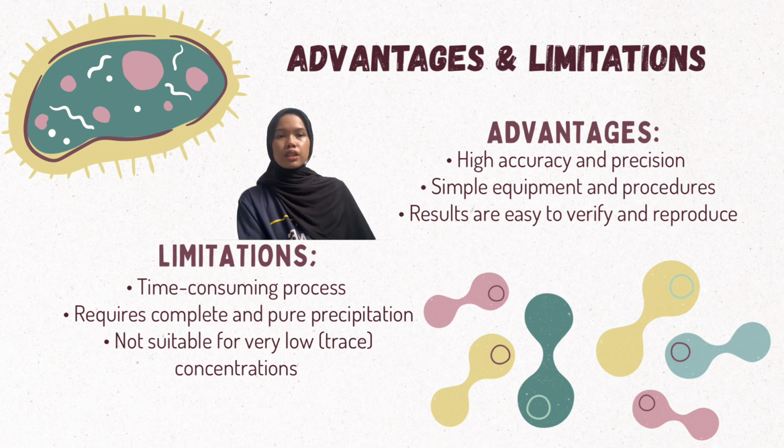But for the limitations, the time-consuming process is very long. It also requires complete and pure precipitation. Thirdly, it is not suitable for very low trace concentrations.